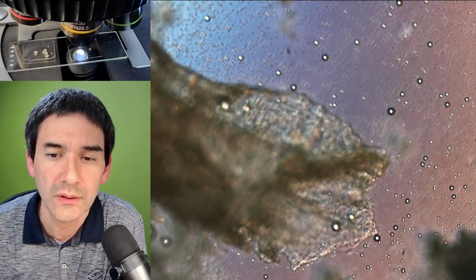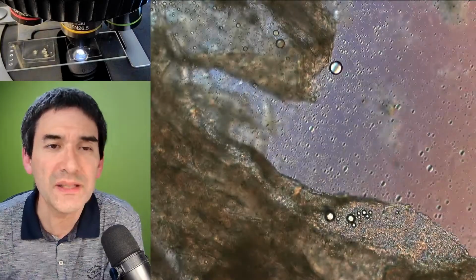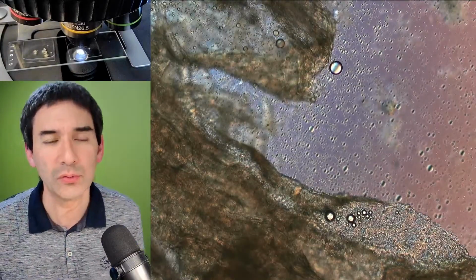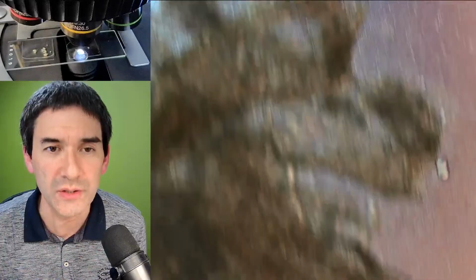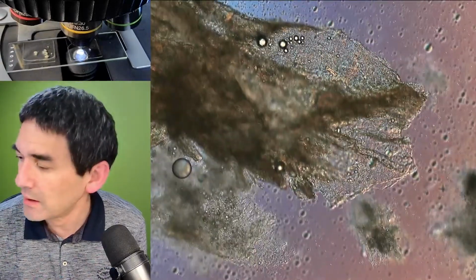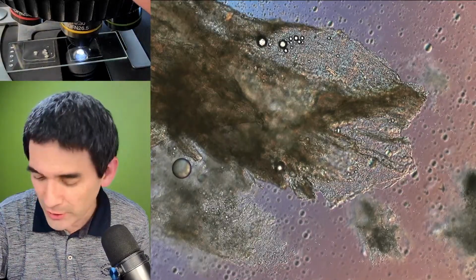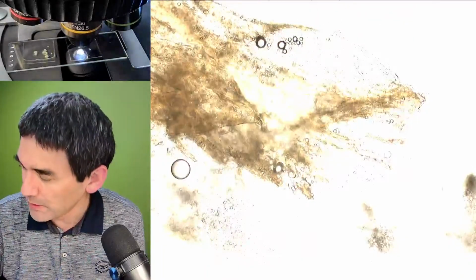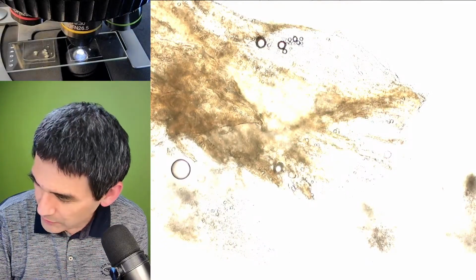What happens if you add a lambda quarter plate? Then essentially, I do not have regular polarized light here. I actually have a so-called Wollaston prism because of DIC. If you know what, let's try, because you're asking. Let's just try normal polarized microscopy. I have to flip this out and take this out.